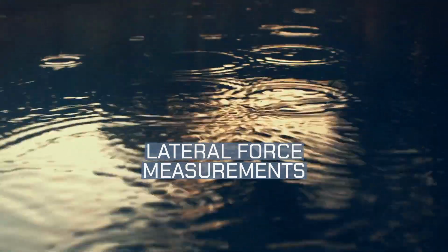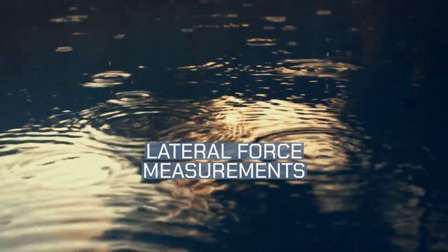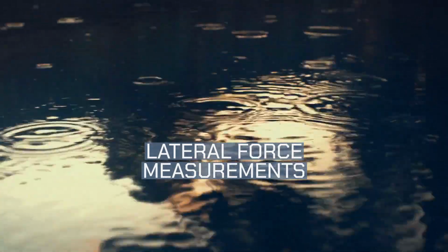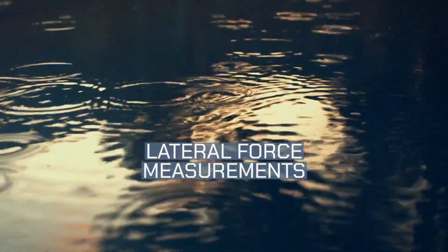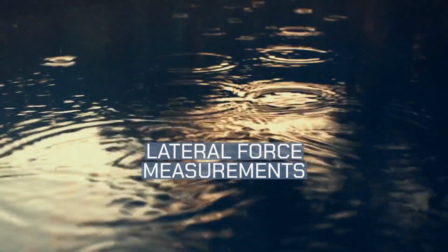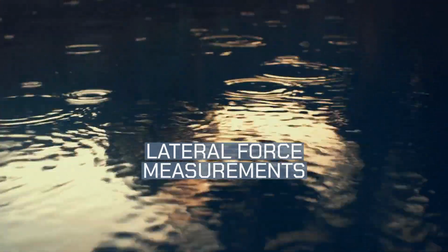As this method relies on heavy mathematical processing, in which each step assumes a vertical motion of the tip, it is critical that the sensor is not angled and that the tip length is very short compared to the length of the sensor. A direct measurement of lateral forces is possible by using a torsional mode with a silicon cantilever or by orienting the sensor to oscillate parallel to the surface. Using the latter technique, Weymouth et al. measured the tiny interaction of two CO molecules as well as the lateral stiffness of a CO-terminated tip.